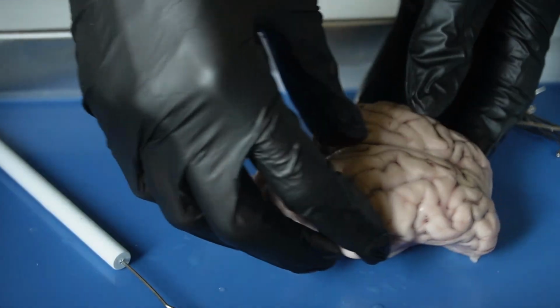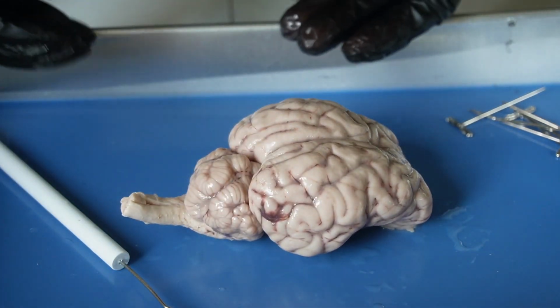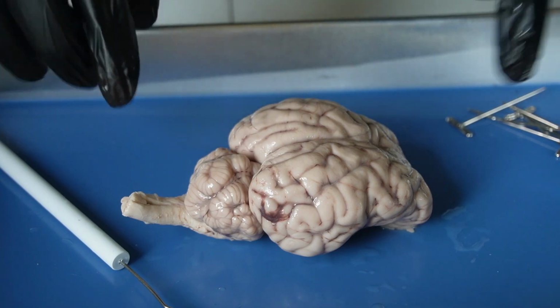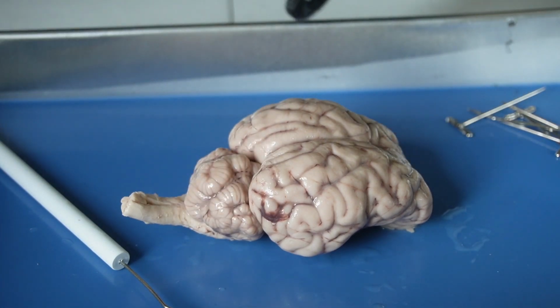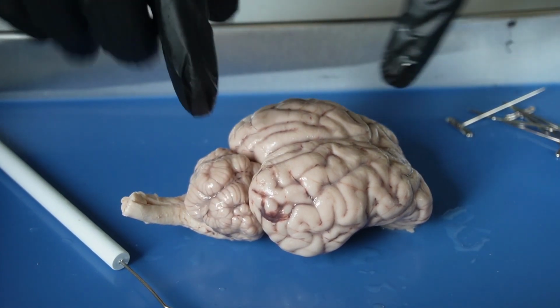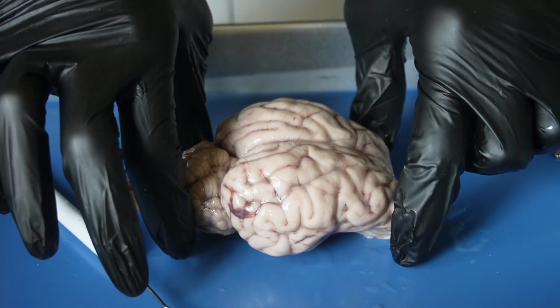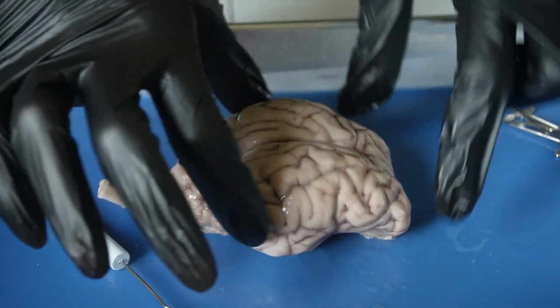Okay, so if I were to make my incision sagittally, oh wait, but before I even do that, I forgot to mention the next brain structure.